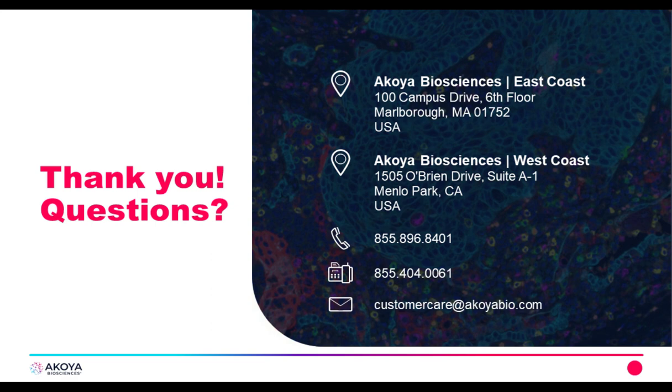Thank you. Can I use flow software to analyze output data? Yeah, that's also a good question. The two types of files that are produced by the CODEX are the FCS files and the TIFF images. And the flow software is going to be able to process those FCS files. So yes.